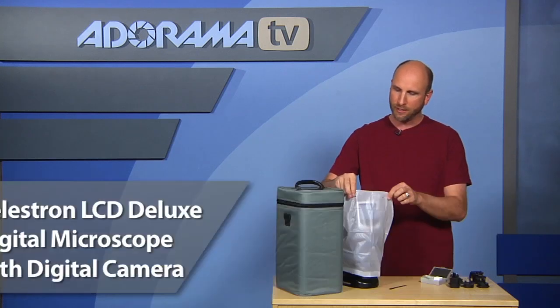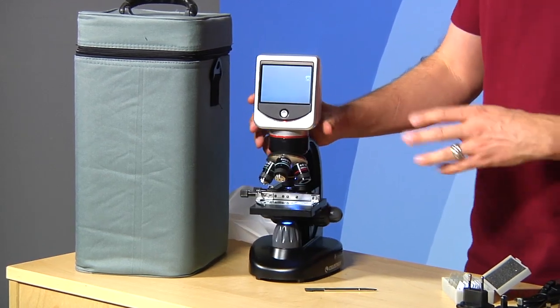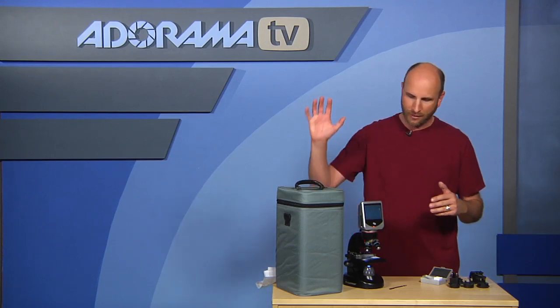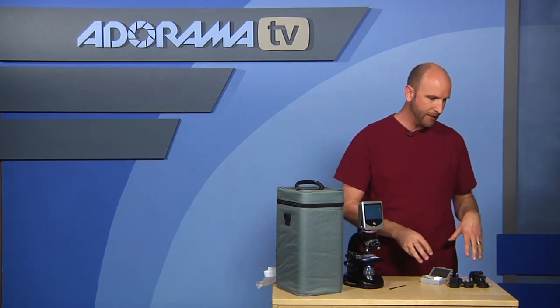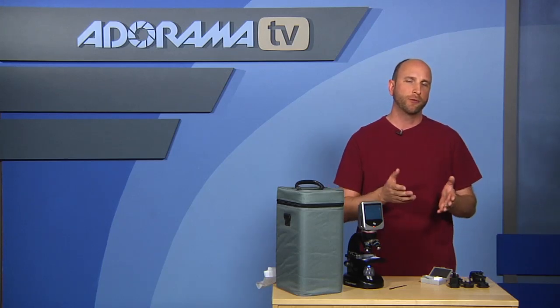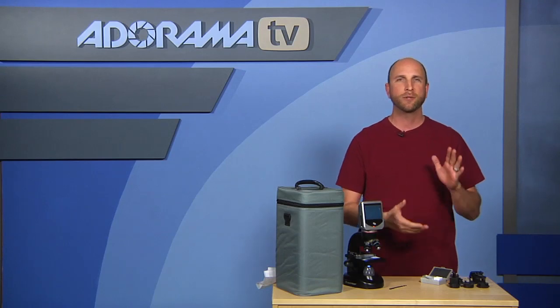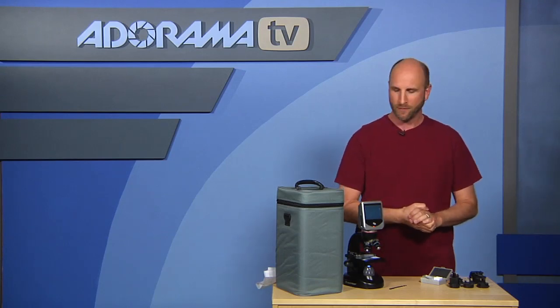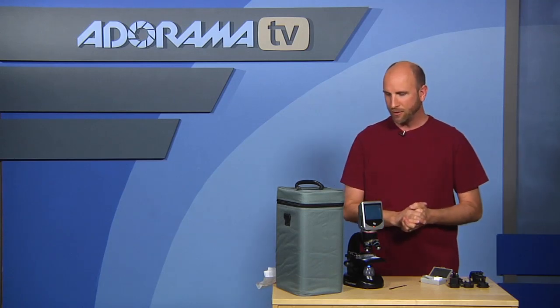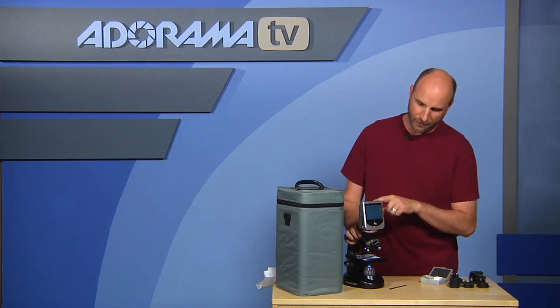It's right here. It has this really nice dust cover, so let me take that off so you can actually see the microscope. It is a microscope and a digital camera all in one. This whole kit comes with a case, a stylus, some slides, and a bunch of stuff — all for about $250. And if you realize, like I did last week, that Christmas is approaching pretty quickly, now is the time to start looking at gift ideas. If you have somebody with an inquisitive mind, you might want to look at this microscope — it's pretty cool.